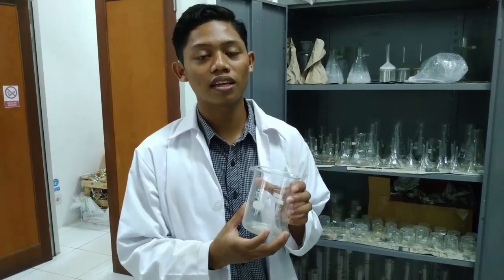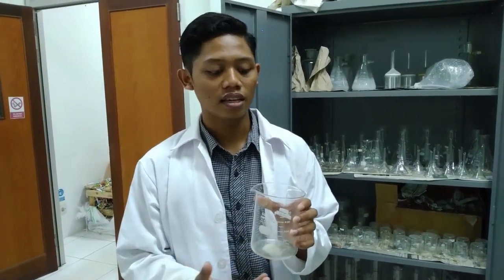Sebelum melakukan praktikum, saya akan memberitahu alat-alat apa saja yang akan digunakan. Bahan yang digunakan adalah daun sirih. Gelas kimia di sini menggunakan gelas kimia 500 ml, yang nantinya digunakan untuk menyimpan hasil ekstraksi, kemudian akan ditutup menggunakan aluminium foil agar larutan tersebut tidak menguap.